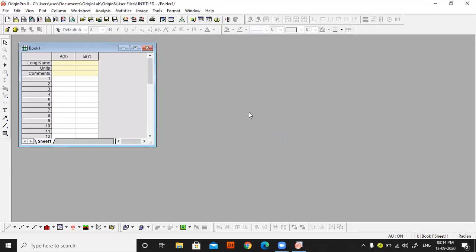So first of all, you have to install the thing, which is Origin Pro 8.0 that I am talking about today. Then we'll open the app, then we'll get this screen. Now whatever data you want to plot, suppose you want to import some data. You have some XRD, some UV visible data, some data of FTIR.